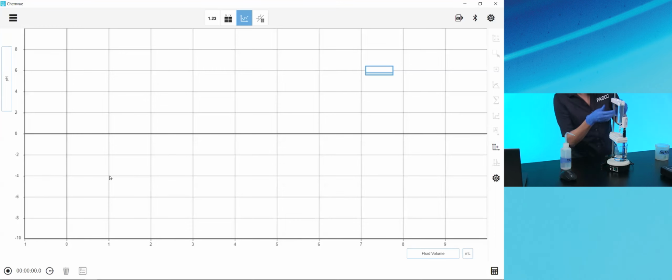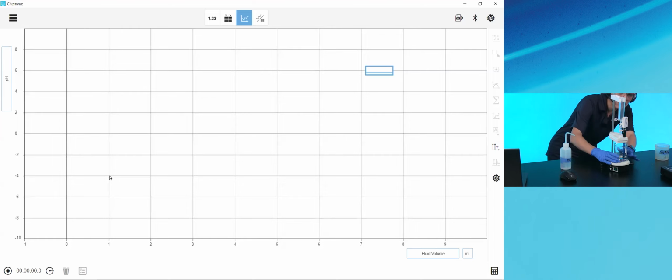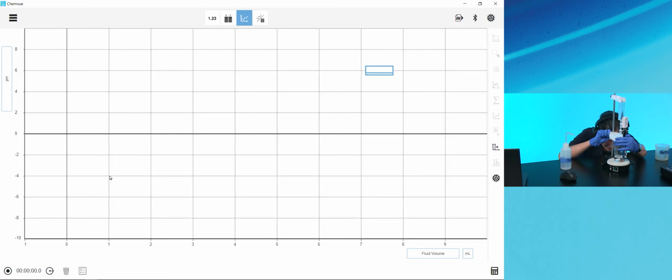That's probably okay. Well, here's how to adjust for the titration. Now I'm visually looking and making sure that my sensor is not going to touch the bottom of the beaker. It's touching solution only and won't touch the magnet when I turn on the stir plate.